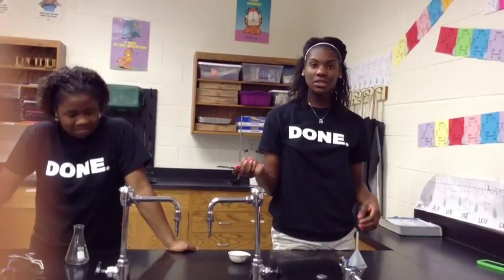Hi, I'm Sophia. Hello, my name is Devon. First off, we have a scalpel — you use it to cut certain things. Anything, just cut it.